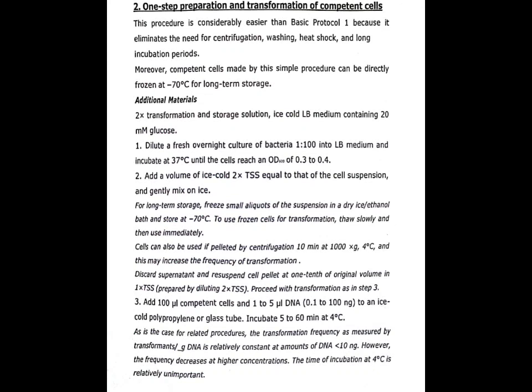As in the case for related procedures, the transformation frequency, as measured by transformants per microgram DNA, is relatively constant at amounts of DNA less than 10 ng. However, the frequency decreases at higher concentrations. The time of incubation at 4 degrees Celsius is relatively unimportant.